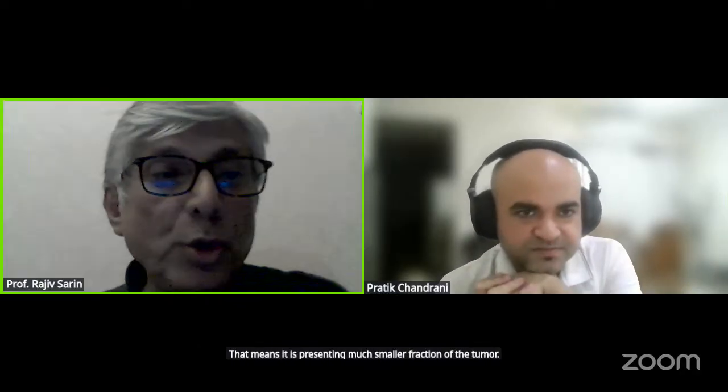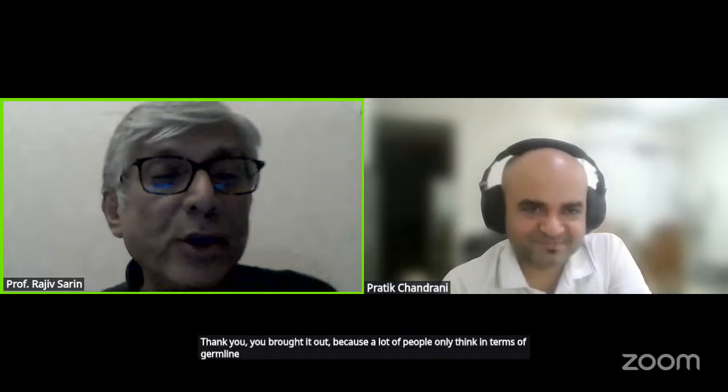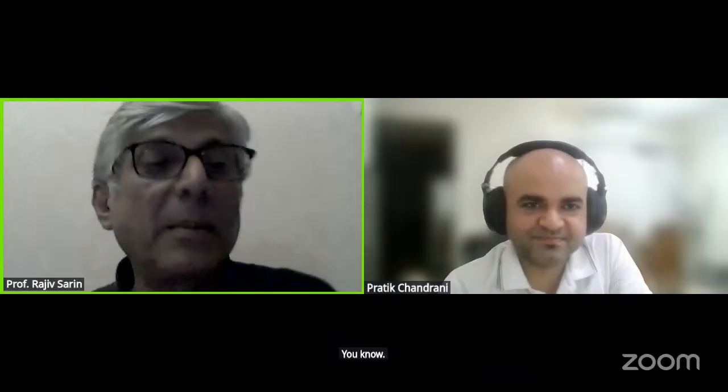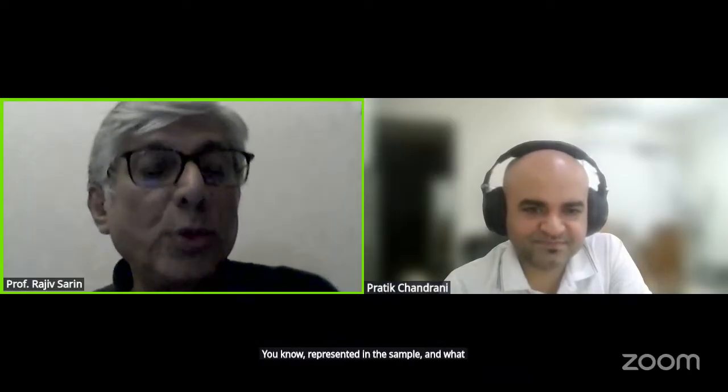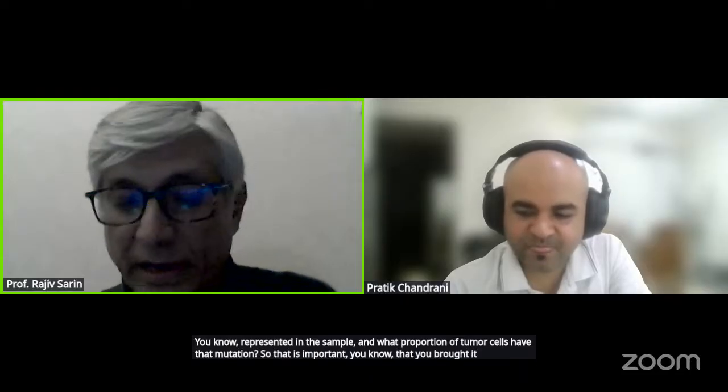Thank you. You brought it out because a lot of people only think in terms of germline. In tumor, it depends what proportion of tumor is represented in the sample and what proportion of tumor cells have that mutation. So that is important. You brought it out very nicely.